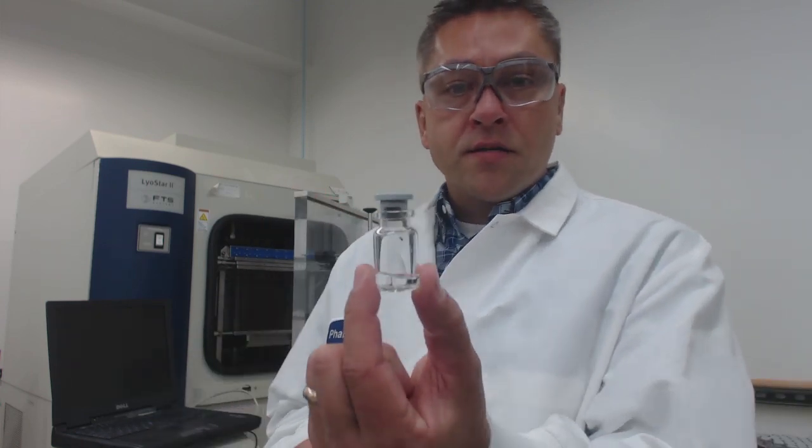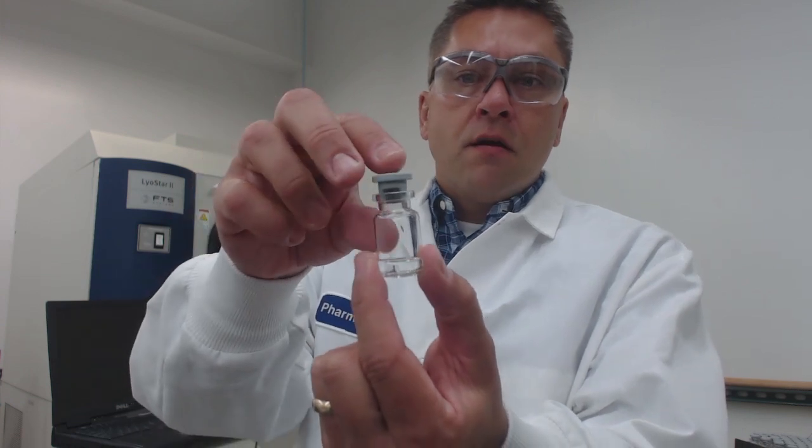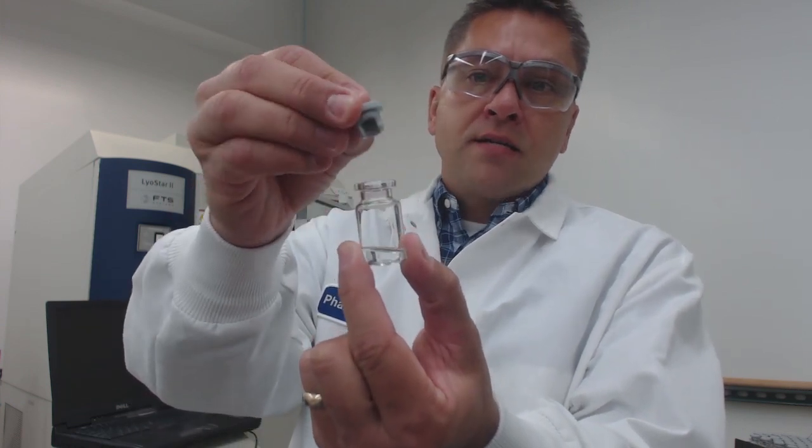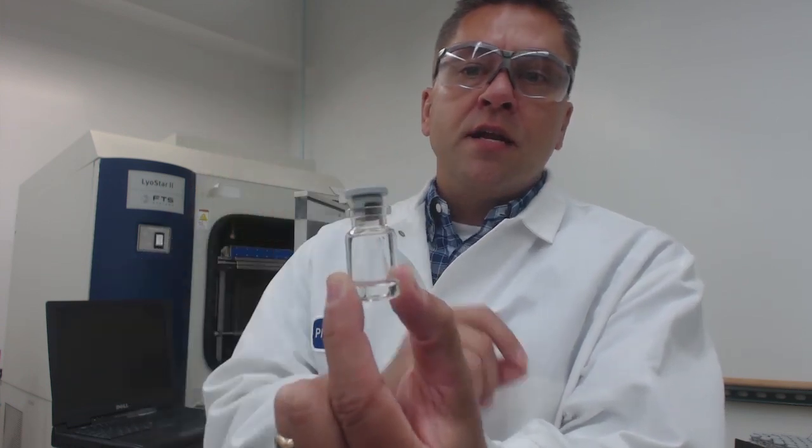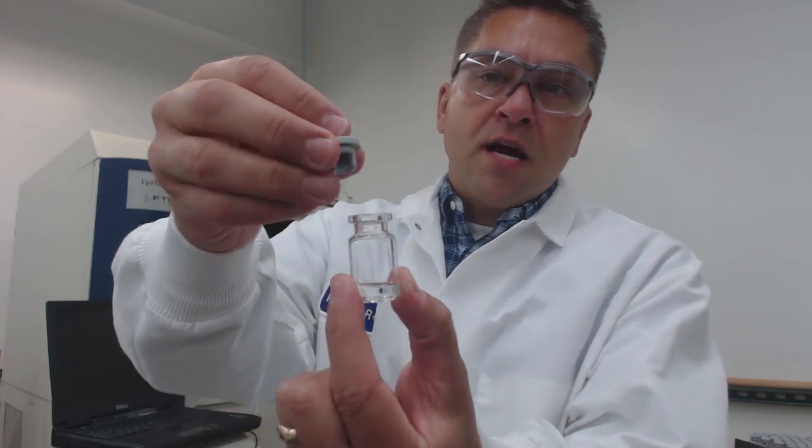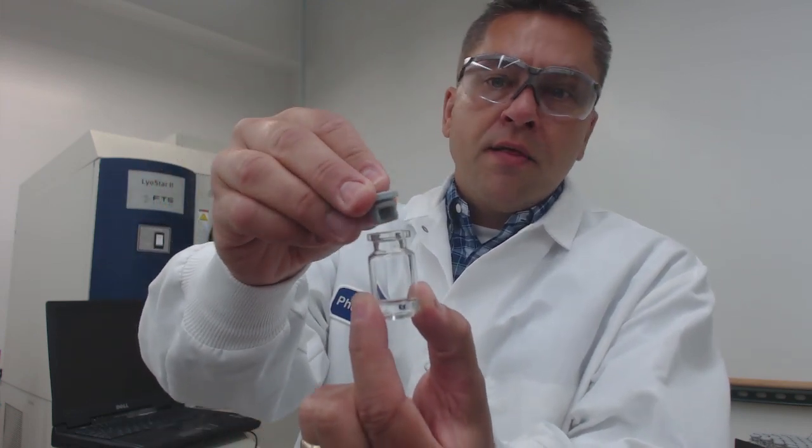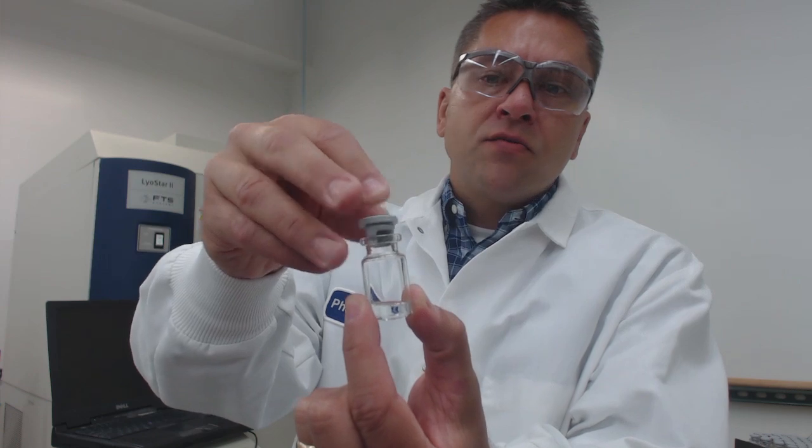Something else you may have noticed is that, unlike a solution formulation, this formulation has a stopper that is partially seated. You'll see that this stopper has a single vent. That single vent allows for the escape of water vapor during the process.